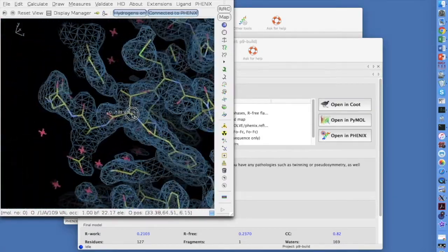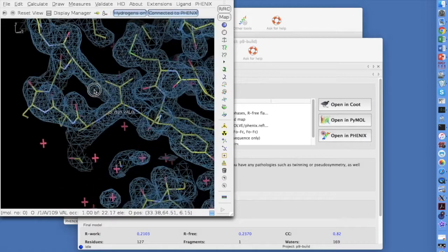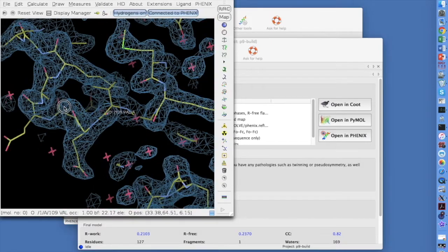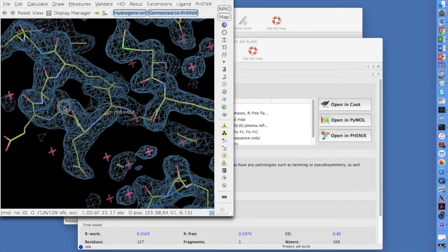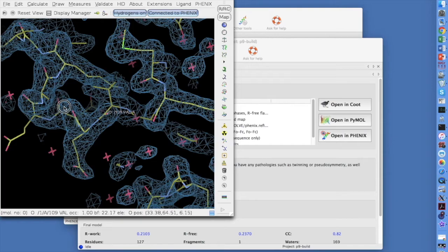The next step after running Auto Build is to run Phoenix Refine and to use the Coot interface to Phoenix Refine to fix up problem areas in your model. Then you can carry out more cycles of auto building and manual improvement until you have a complete model. You might then run Ligon Fitting to place any ligands in your model, followed by final refinement.